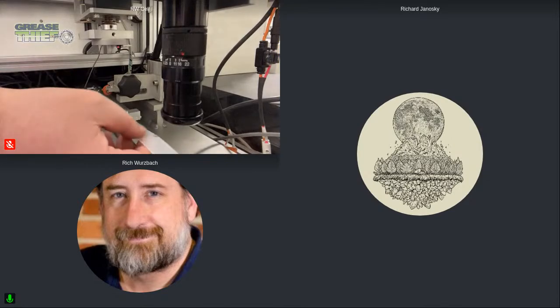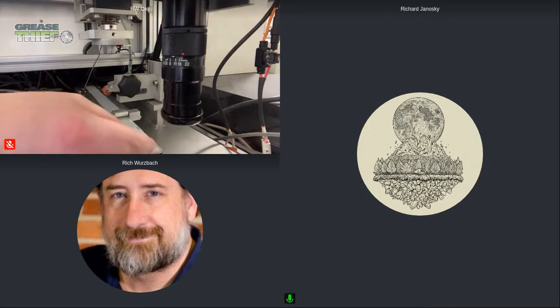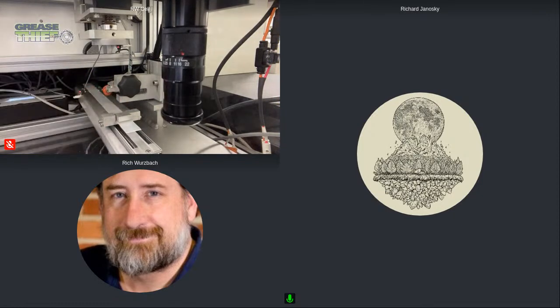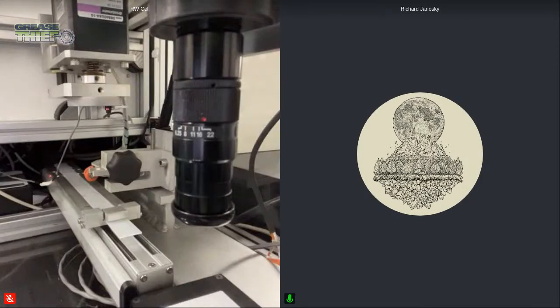It was, and when we pull the camera out, I can pull that one up and show the shark toothing that we sometimes see on reference baseline or reference greases, and we can discuss that. Okay. This one's got some wear in it, and we're not actually going to be able to extrude. It was an R&D sample that I thought we might be able to extrude, but it's too thick. So we'll have to use this one.